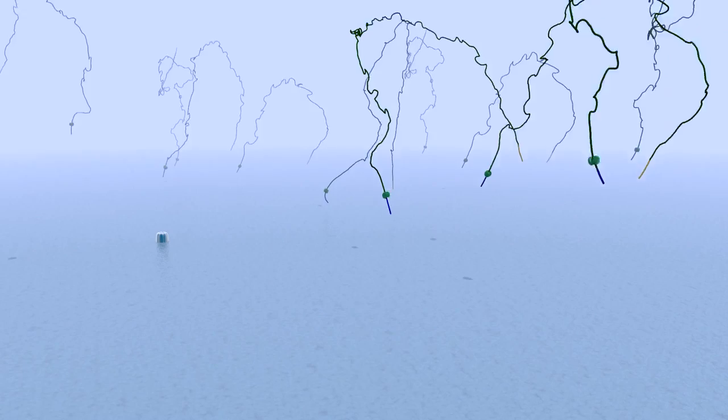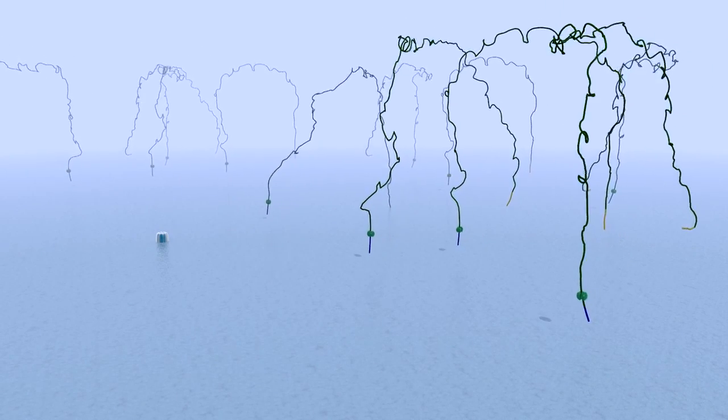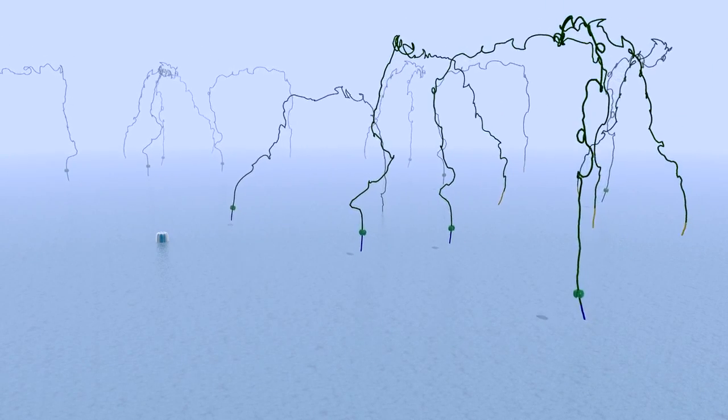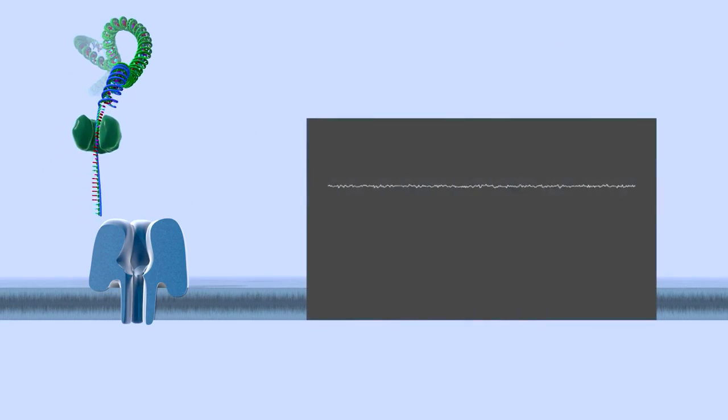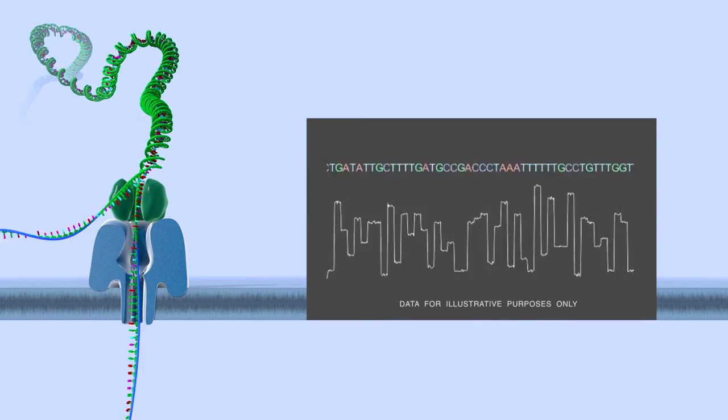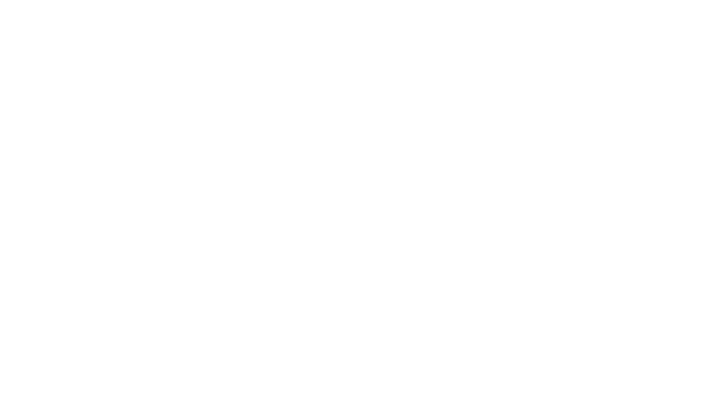The DNA strands to be sequenced are mixed with copies of a processive enzyme. As the DNA enzyme complexes approach the nanopore the single-stranded DNA is pulled through the aperture of the nanopore.